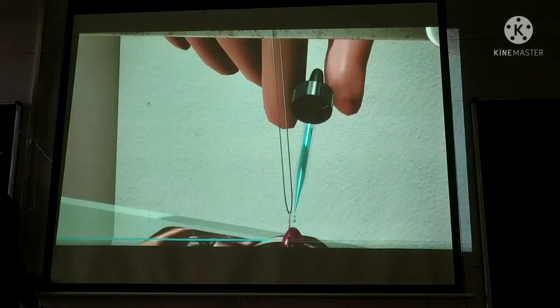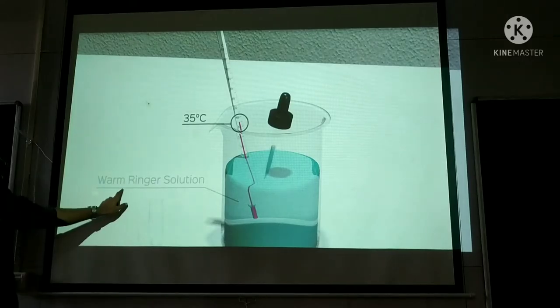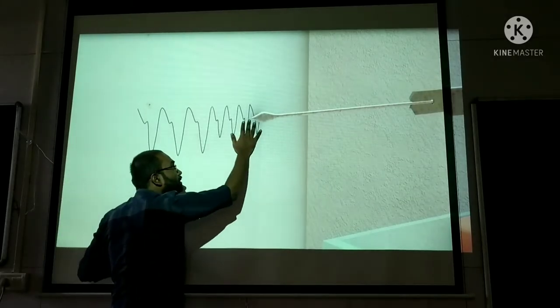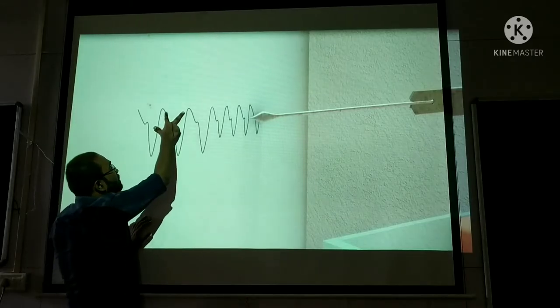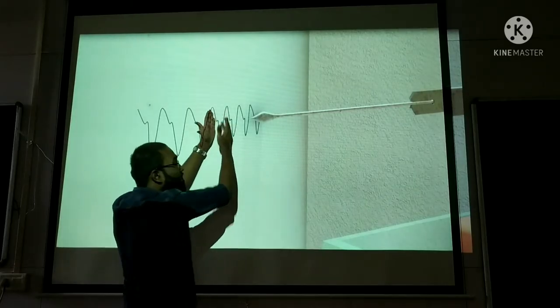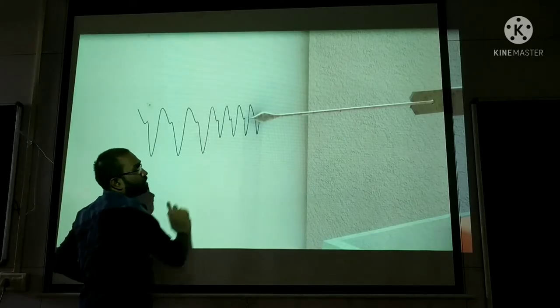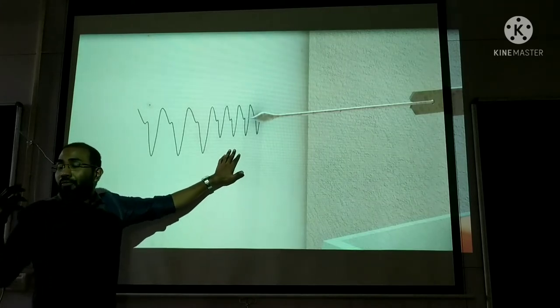Now they add the warm ringer solution. Here you can see the normal cardiogram versus the warm ringer solution cardiogram. With warm ringer solution, two things are observed: the heart rate has increased, and the height of contraction — force of contraction — has decreased. So warm ringer solution gives an increased heart rate but decreased force of contraction.